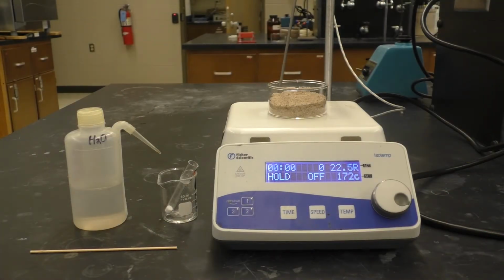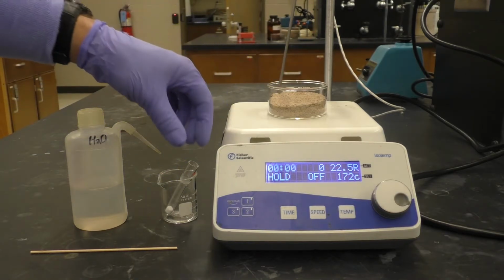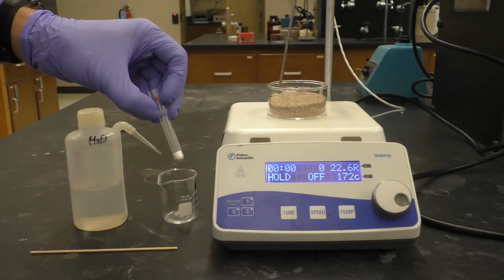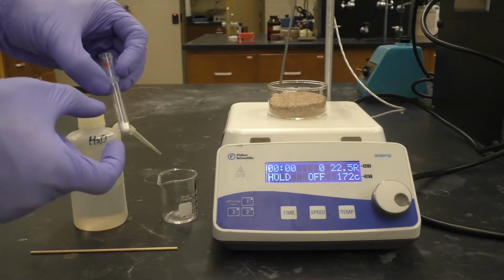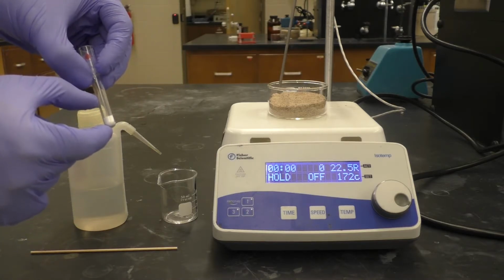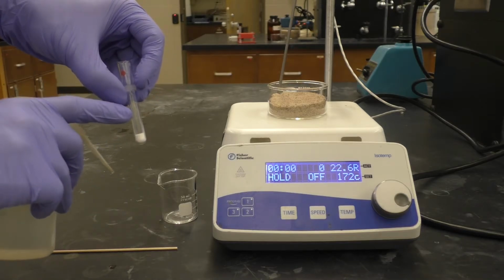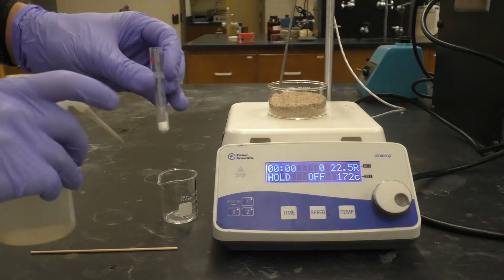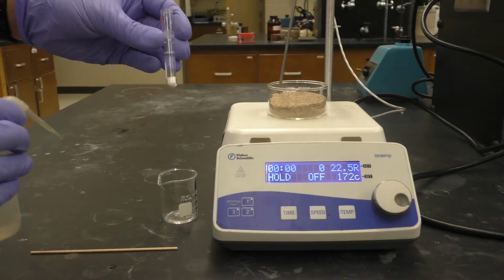So here we have the setup for the recrystallization. We'll have a hot plate with a sand bath in it. And I've got my Craig tube with my material. At this point I'm going to add a certain amount of solvent for the recrystallization. I'll put a little bit of an excess. I want to add approximately up to maybe here or so on the tube of water. I don't have to worry too much since it doesn't dissolve at room temperature. There we go.